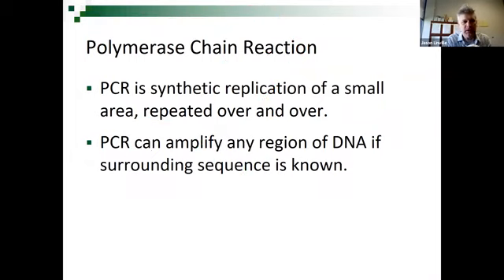Okay. So how do we amplify DNA? What is this process? PCR, the polymerase chain reaction. Synthetic replication of a small area repeated over and over.